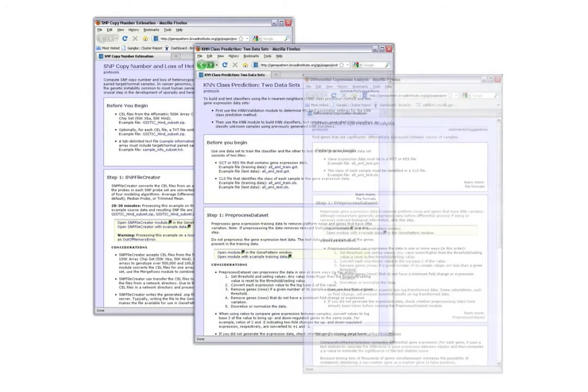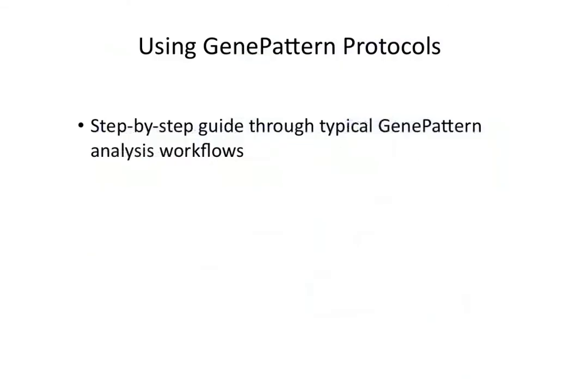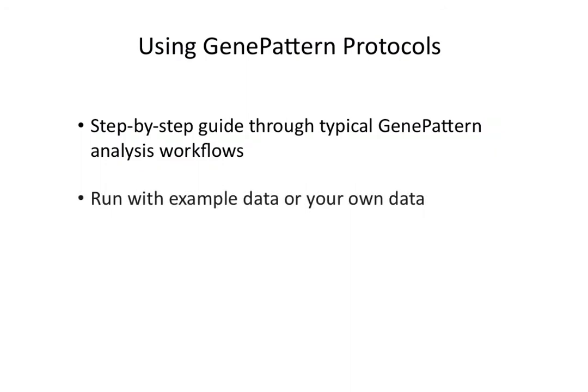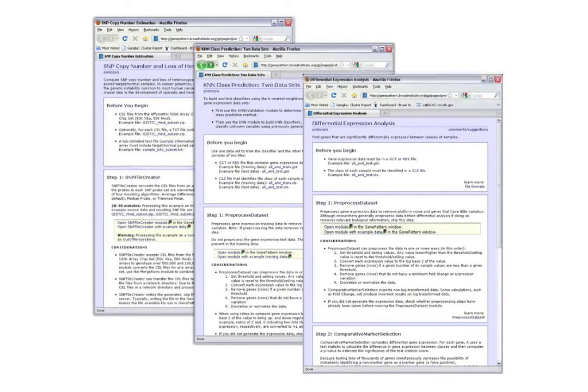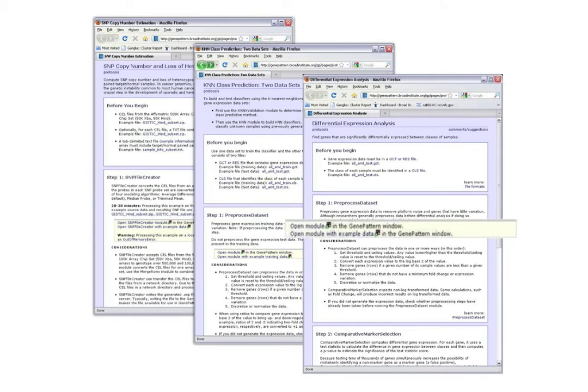In all protocols, and in each step of the protocols, you may choose to run the example with our test data or use your own. Using a protocol is a great way to start learning about how to analyze your data in GenePattern.